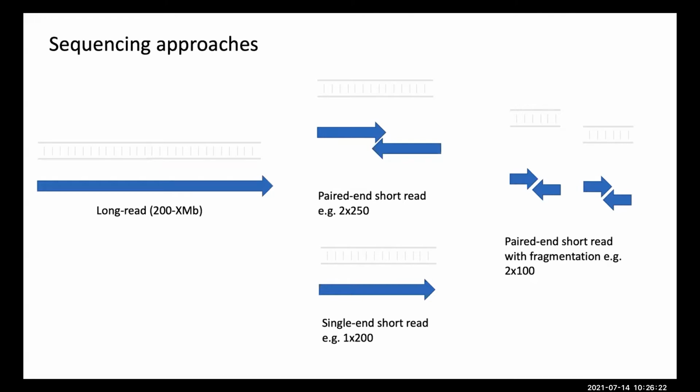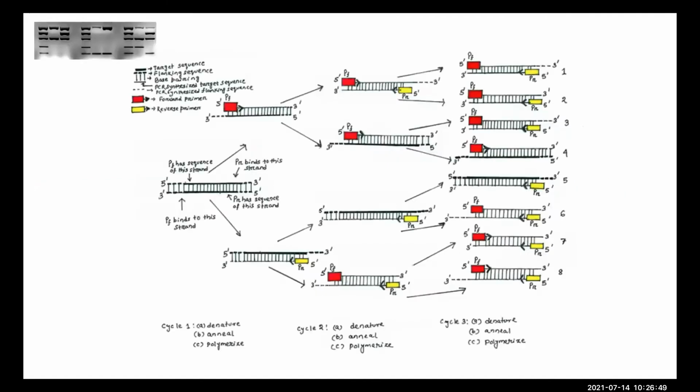Because we're doing nanopore sequencing here, we're only really thinking about the situation on the left. But there are a lot of people who prefer to take the ARTIC amplicon, take the PCR step from the beginning of the ARTIC process, and then put it into other technologies, either Ion Torrent or Illumina, with either paired end sequencing or fragmented paired end sequencing, for example, Nextera. So these are some concepts that are important.